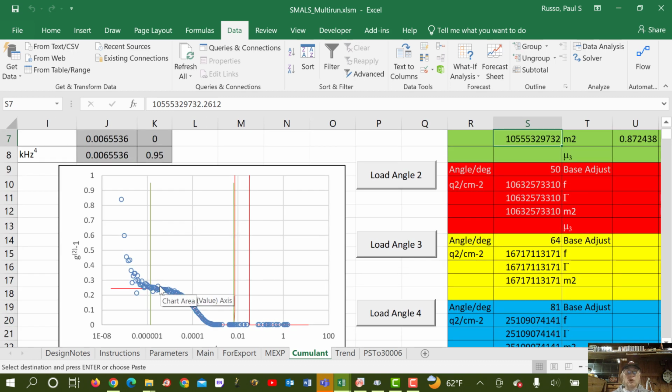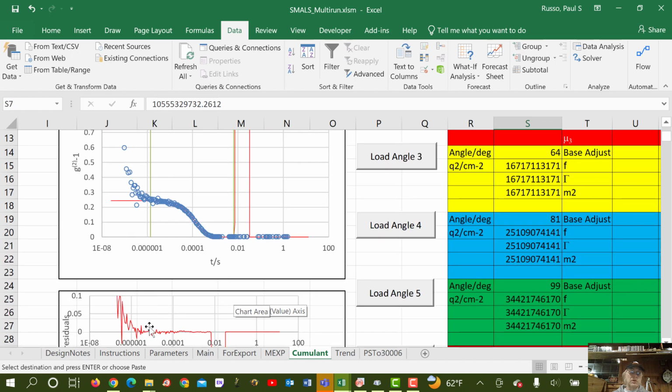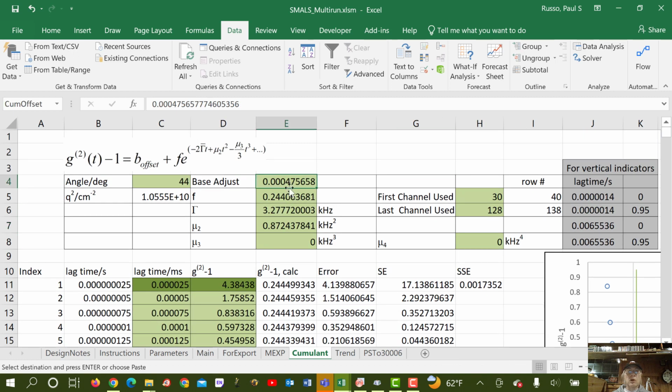It is a cumulants fit, so of course the data are going to go tearing off at the end after that cumulant term becomes kind of dominant. We might be fitting too many channels here. It seems like we're getting a nice fit through the data all right though. Residuals plot looks pretty good in our range, just here on, kind of random. And what about the offset of the baseline? Very small offsets of baseline here, because we also have the mu2 parameter to fiddle around.